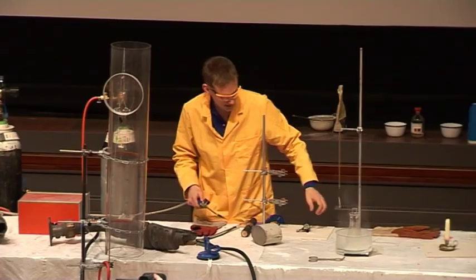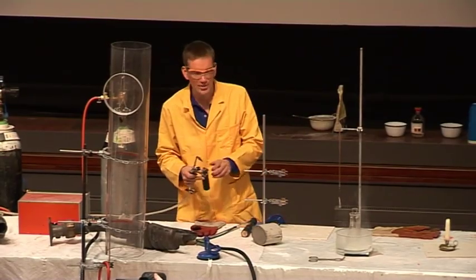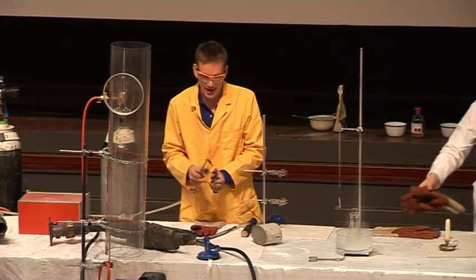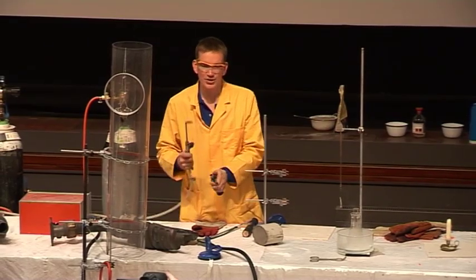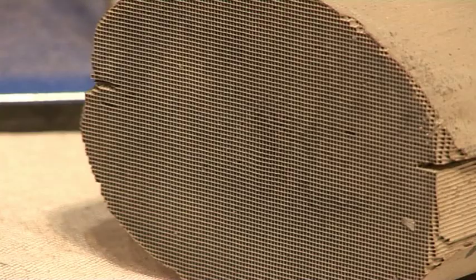Okay, now we can show this with some hydrogen. Now, with this particular catalyst, we do need to sort of warm it up before it works well. So I have a hydrogen jet here. I'm just going to light the hydrogen. It's very difficult to see the hydrogen, but it is now lit. And I'm just going to warm up the catalyst.